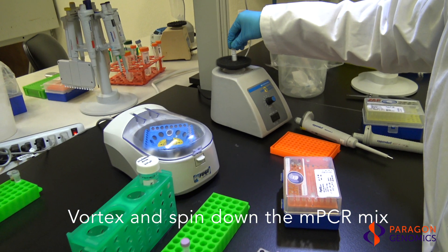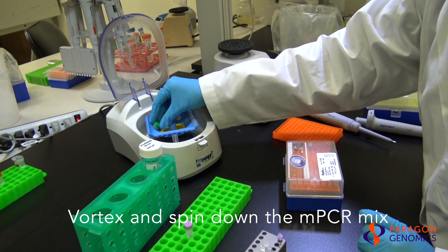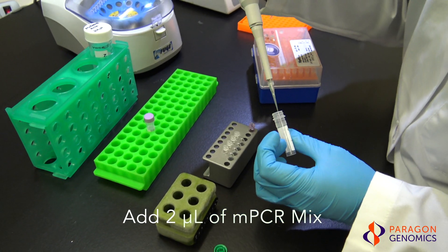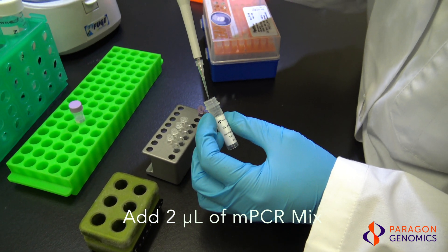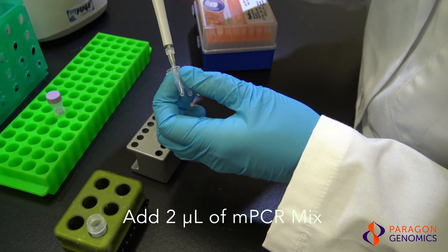Next, vortex to mix and quickly spin down the multiplex PCR mix before adding to the PCR tubes. Add two microliters of multiplex PCR mix into each PCR tube. As the multiplex PCR mix is viscous, ensure accurate dispensing of the reagent by pipetting slowly and rinsing the tips in solution as needed.